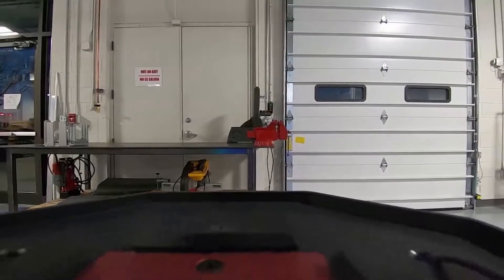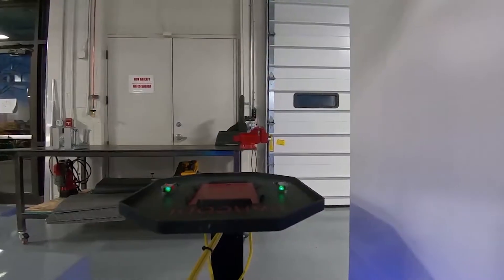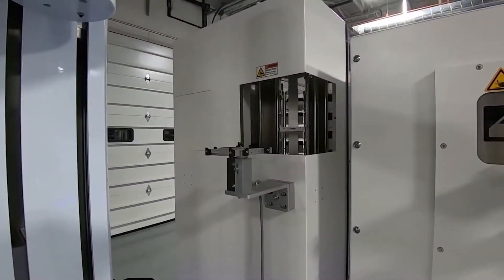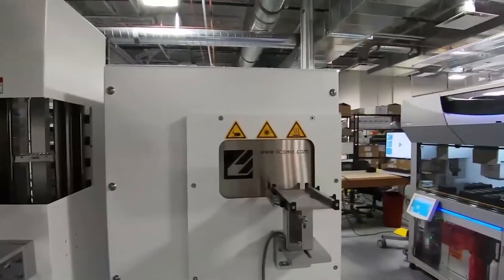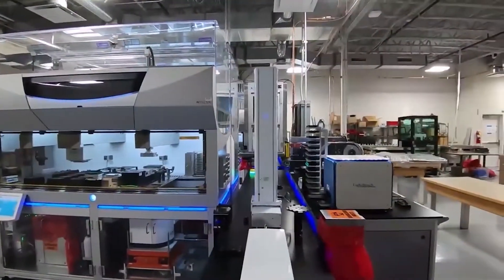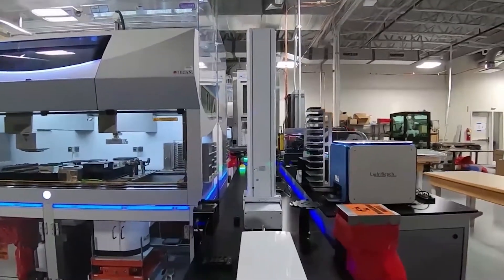We're really excited to show you this brief video. I'll warn you it's a little choppy because of the connection between this monitor and this screen, but you're actually the first ones outside of the airUP lab to see the work cell. So I'm going to walk through just a little bit of it.